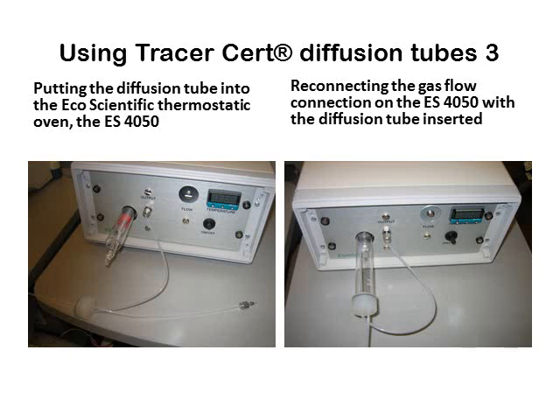Care should be taken to allow the diffusion to adequately equilibrate at the set temperature before starting the regular weighings for the weight loss estimation for calibration. Periodically weigh the tube over a period of hours, days or weeks in order to collect sufficient weight loss data versus time to estimate reasonably well the diffusion rate of the vapour out of the tube using linear regression analysis.